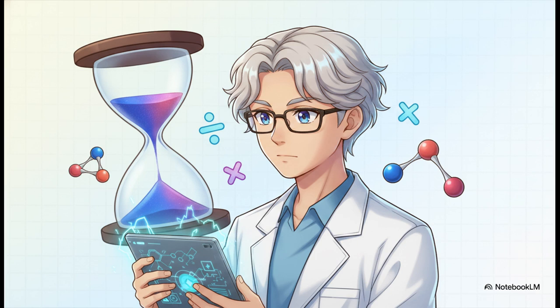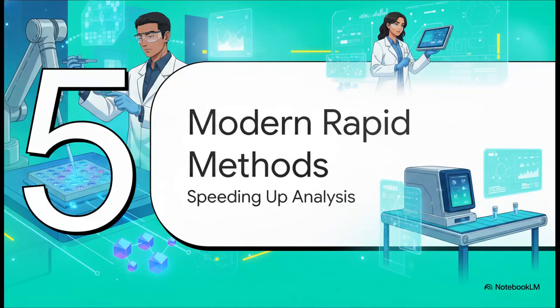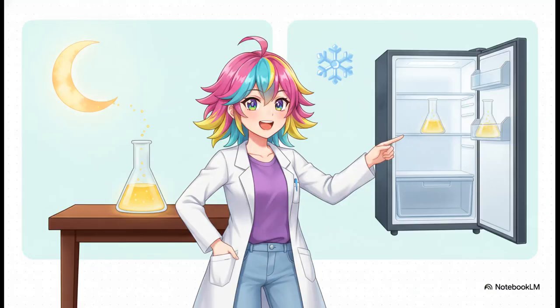It's incredibly elegant, but as you can probably tell from all these steps, this traditional method takes a very long time, often spanning overnight. Which perfectly sets up section 5, modern rapid methods. So research published in the Pakistan Journal of Biotechnology focused exactly on this time bottleneck. In the traditional standard method we just discussed, that yellow precipitate is left to settle overnight. That means the full analysis literally takes 2 days.